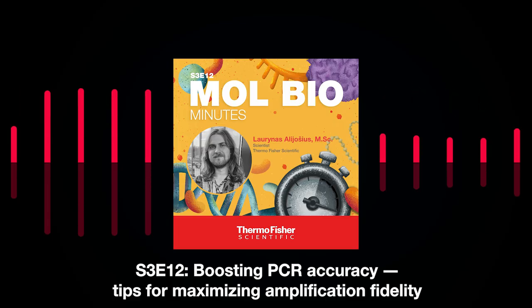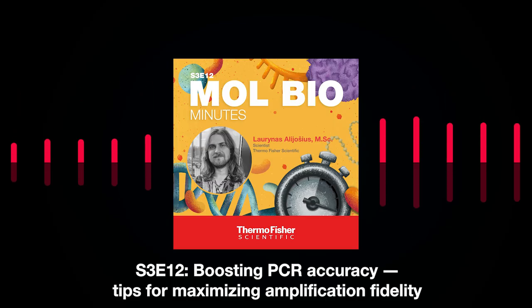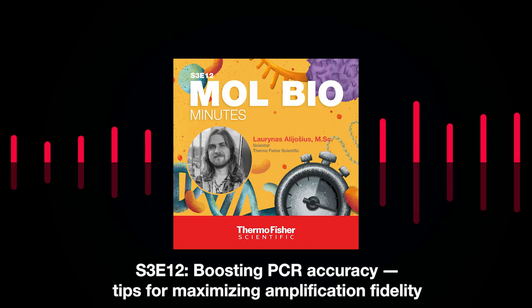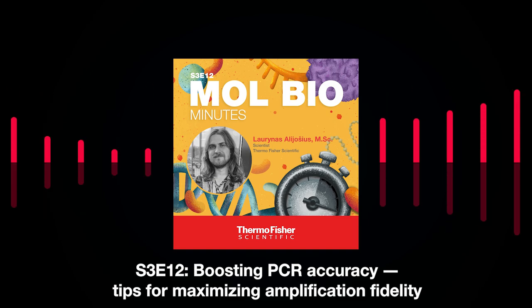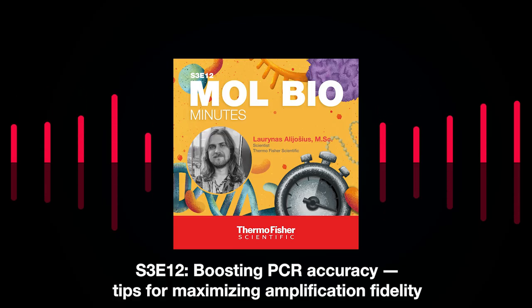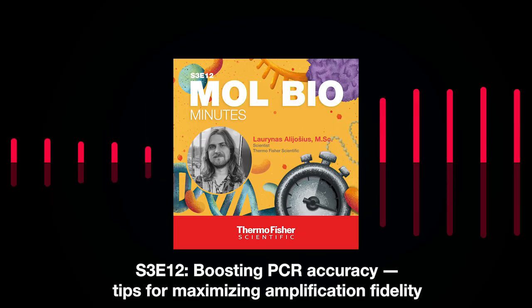The quality of another important component is also important. And that important component is the DNA template. So if there are impurities in your DNA template sample, let's say some leftovers from the purification reagents or phenol or salts, all of these leftovers and impurities can impact the quality of your PCR in a negative way. Your PCR can also be compromised if your DNA sample is contaminated with some foreign DNA.